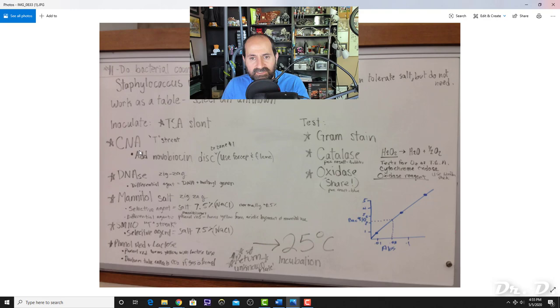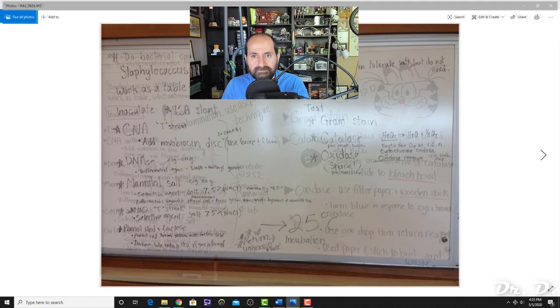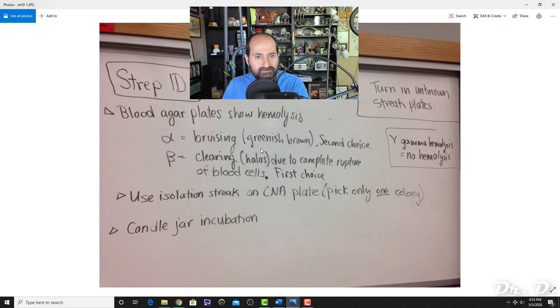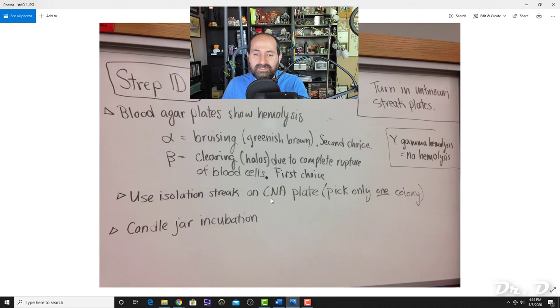The CNA plate (Columbia Nalidixic Acid) is both selective and differential. It's selective because nalidixic acid prevents gram-negative bacteria from growing and only permits gram-positive bacteria to grow—it selects against gram-negatives and selects for gram-positives. It is also differential because it has blood agar, allowing you to observe hemolysis patterns.